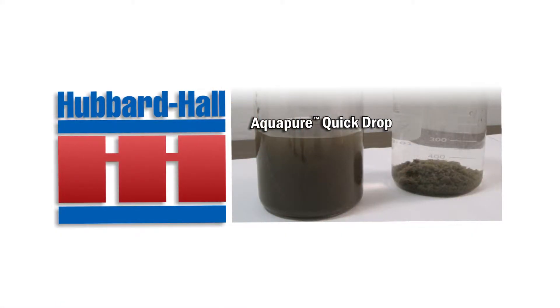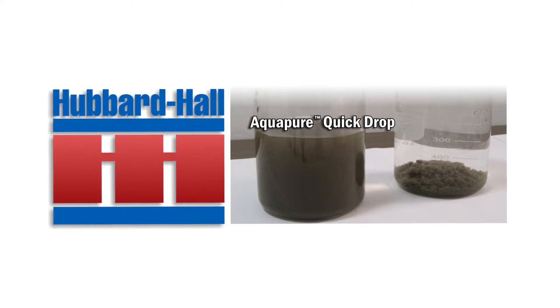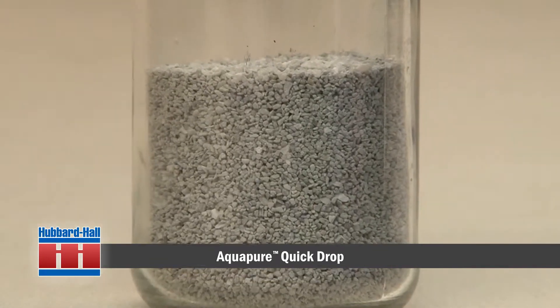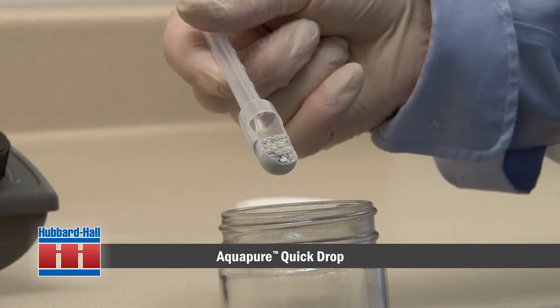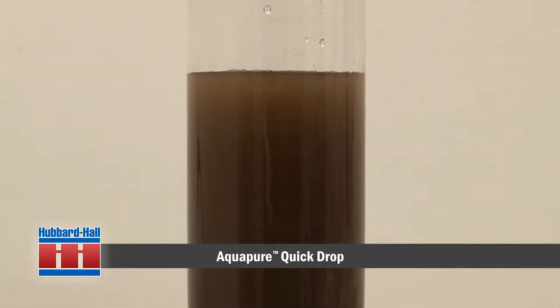What you will see in this demonstration is Hubbard Hall's Aquapure Quick Drop for the treatment of suspended solids in dirty wastewater. Aquapure Quick Drop is a blended proprietary product consisting of bentonite clay and conditioners used for the removal of precipitated heavy metals, suspended solids, and oils and greases in a one-step process.